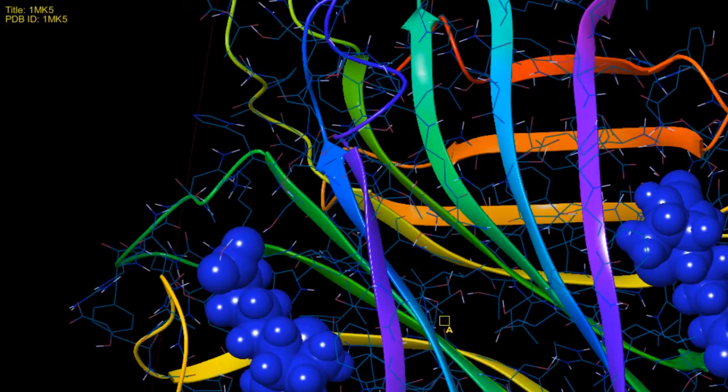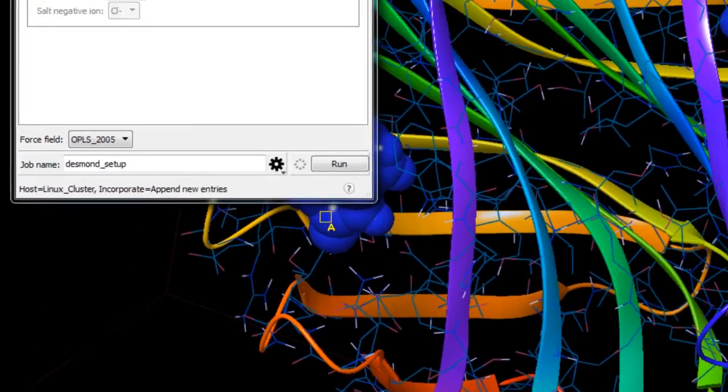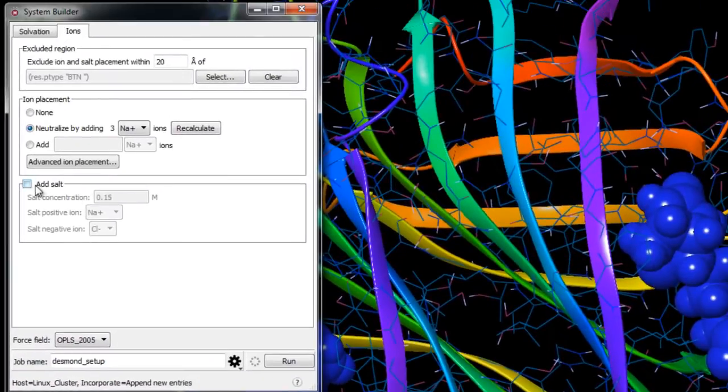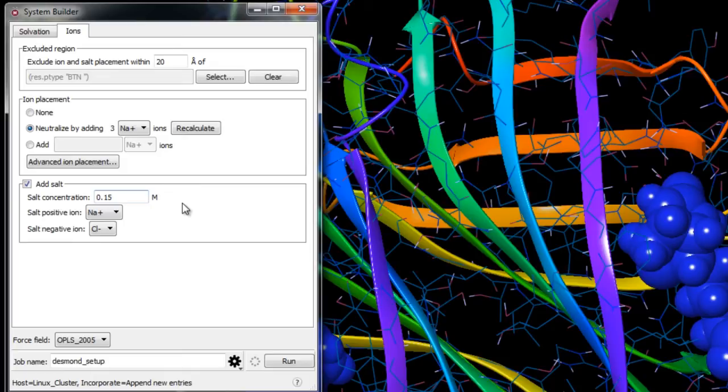Now we'll click Add Salt and ensure the salt concentration is set to 0.15 molar to simulate the background salt at physiological conditions. By default sodium chloride is added, but you can choose a variety of positive and negative ions for your salt.